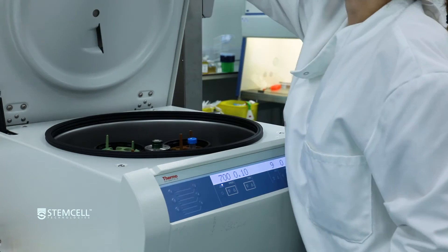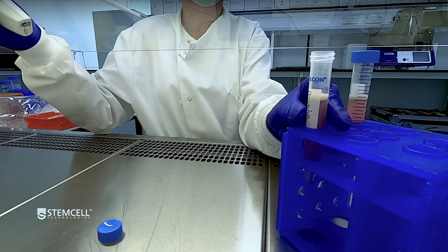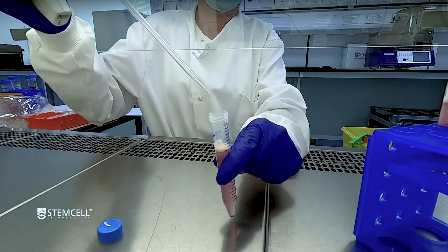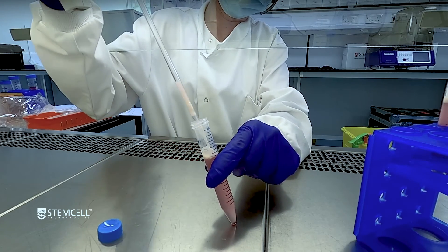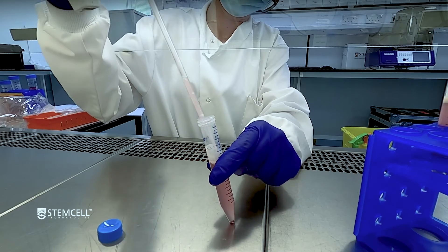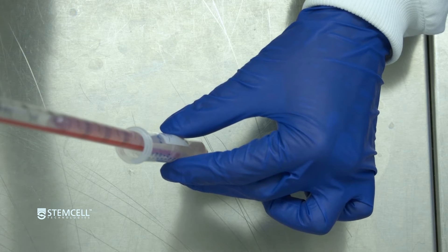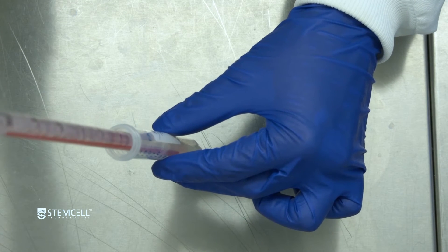Centrifuge at 700 times G for 10 minutes with the brake off. Using a 1 milliliter wide-bore pipette tip or a 2 milliliter serological pipette, carefully remove and discard the upper myelin layer. Using a serological pipette, remove and discard the remaining supernatant.